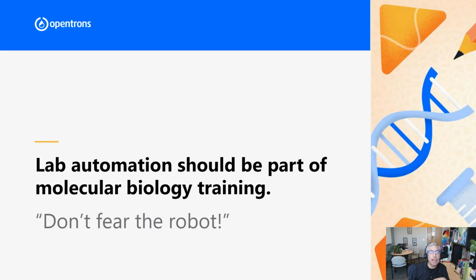I define that as using both instrumentation as well as experimental design to propel advances in generation of new knowledge about active compounds, about cell phenotypes, for example, and learning. And we can learn a lot from how we teach automation to students. I want to share a little bit about that.